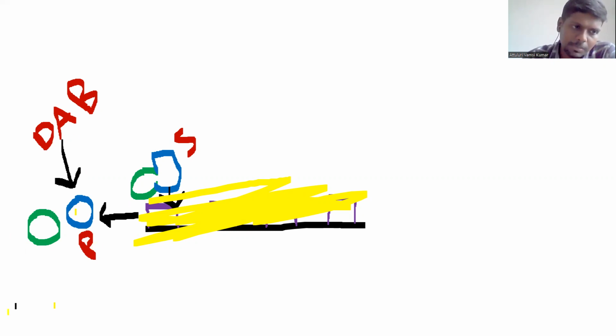Sometimes we will use salts. Sometimes we will use a diazo salt to visualize the product. Sometimes we will use coloring agents, naphthols. So there are four principles and four specific reactions to visualize the products.